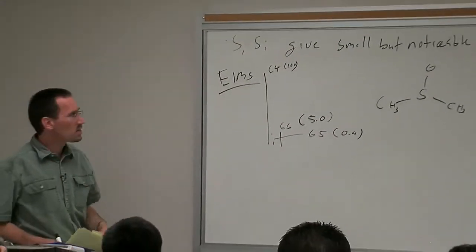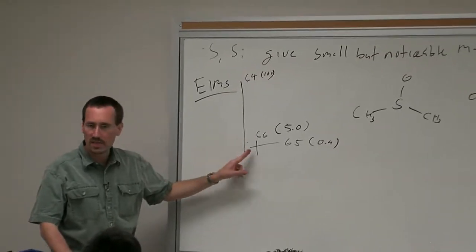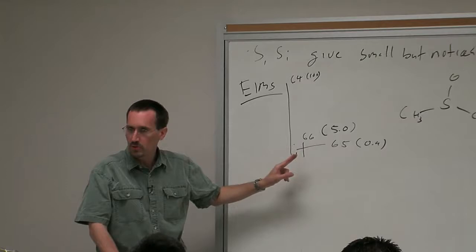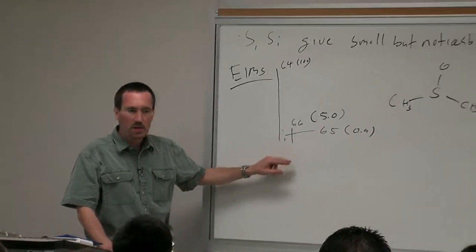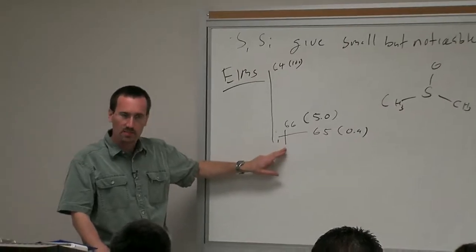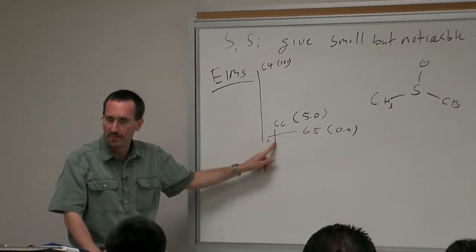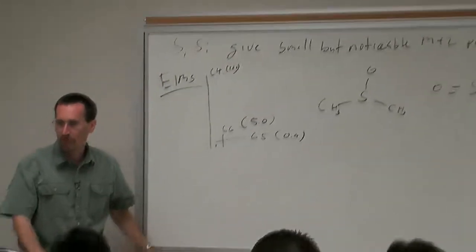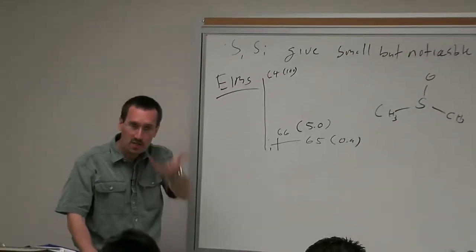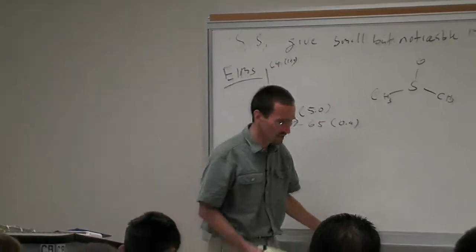So in reality, unless you were doing specific quantitative mass spec for isotopes, which is a whole field in itself, you'd probably just glance at this spectrum and say, hey, I see an M+2 peak, something's up. What fits that mass spec? I bet there's a sulfur or a silicon, and then you'd be scratching your head and doing exactly what you did and coming up with the formula.